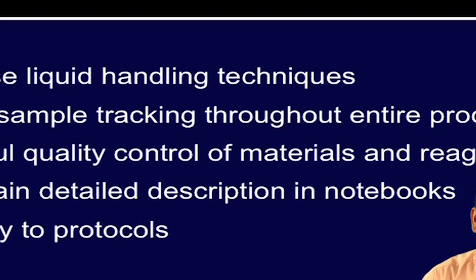You need to keep track of the entire process, so you can troubleshoot if anything goes wrong at any step. It is a good idea to build a detailed log history for each step, from cloning, DNA preparation, printing, etcetera. Now, if you have done this step by step optimization and evaluation, there is less chance of making any errors, because in high throughput approaches, when we are dealing with thousands of features, it becomes important to track everything throughout the experiment and make note of the details.